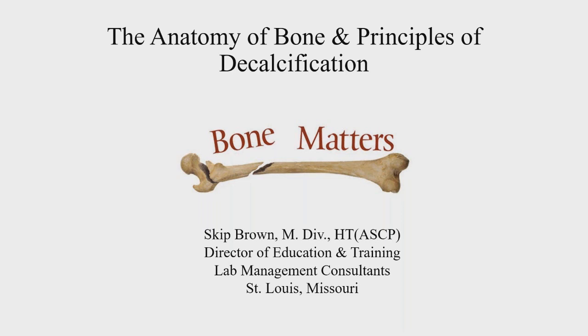Unlike many other tissue specimens, bone has its own special and intricate things going on, based upon the nature of bone as opposed to soft tissue. Things have to be done optimally and delicately before you even start the routine histological process. Otherwise, it's going to impact the pathologist's ability to make an accurate diagnosis. And this is very key when we talk about some types of bone diseases.